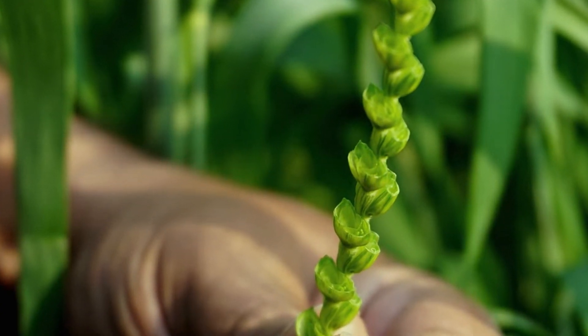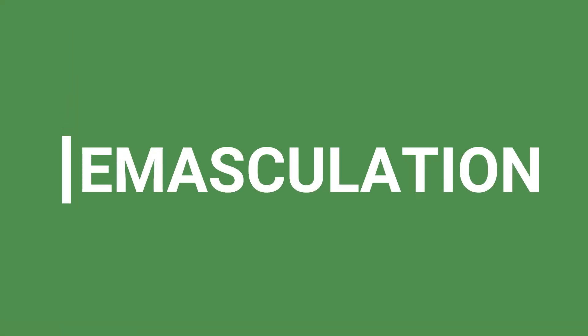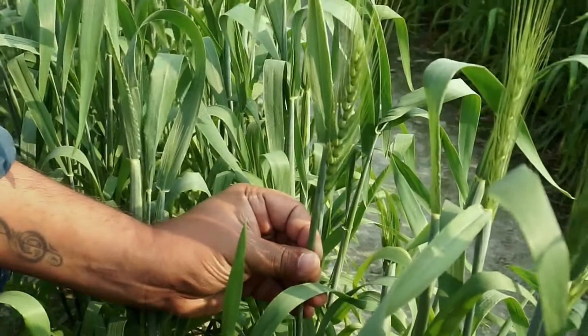Crossing and hybridization includes two steps: emasculation and pollination. For emasculation, a spike which is in late booting stage is selected.